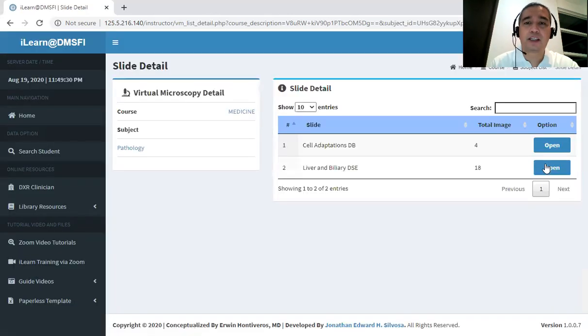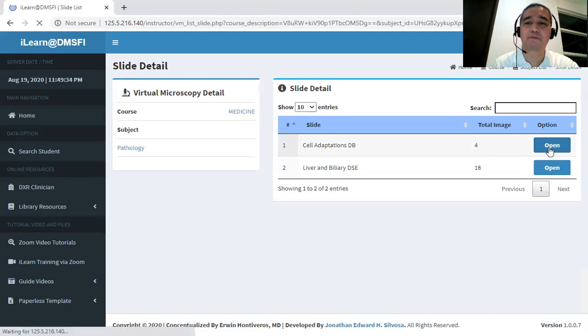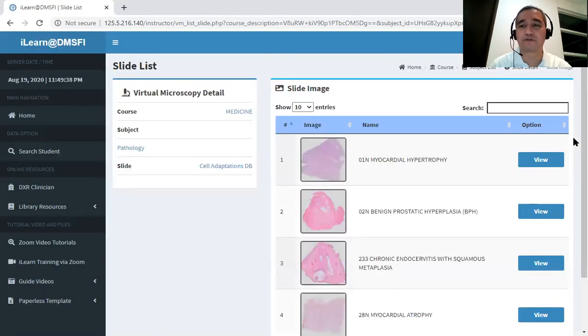And then we have the Cellular Adaptation here. So open it up, and we have four slides for viewing.